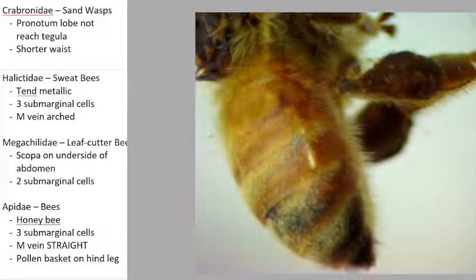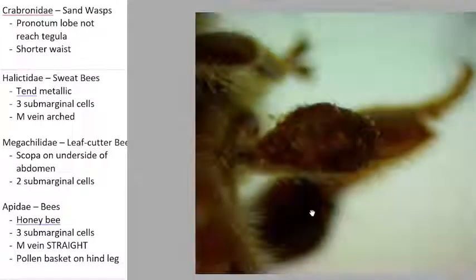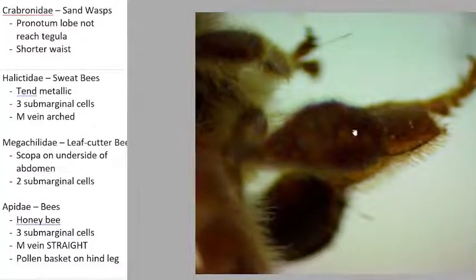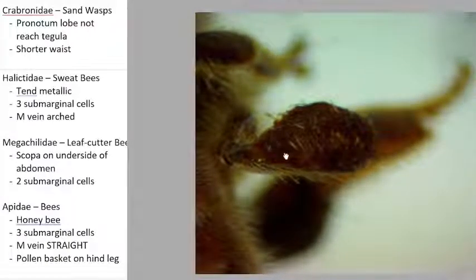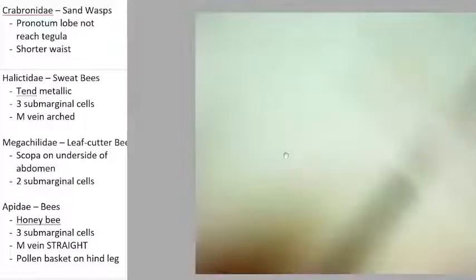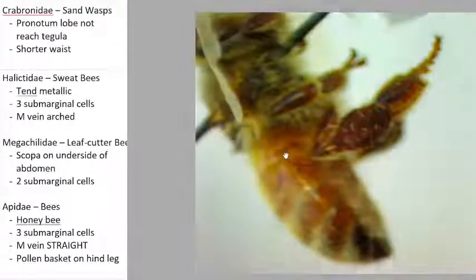Now, my honeybee actually still has some pollen stuck to its leg. All right, so we're looking at the hind leg here. Maybe we can level it out so that the focus isn't so wacky. There we go.